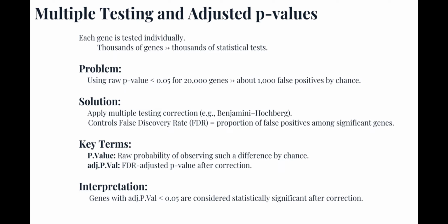It's probably a real difference. So in simple terms, the p-value doesn't measure how big the change is. It measures how confident we are that the observed change, the log FC, is real and not random noise. So in this way, we can check the significance of our results.